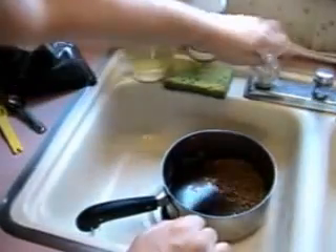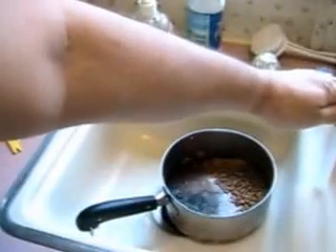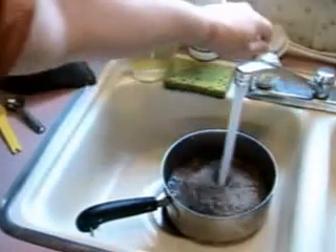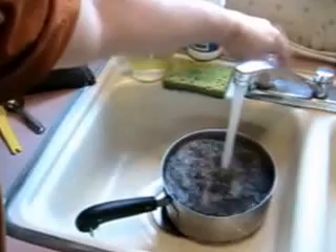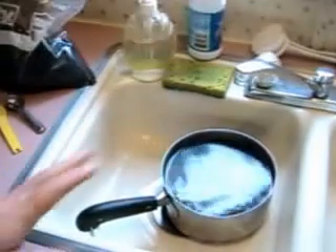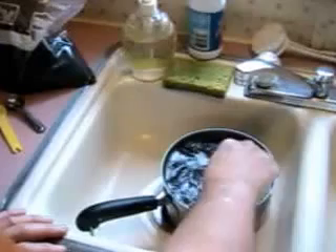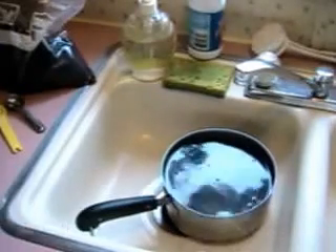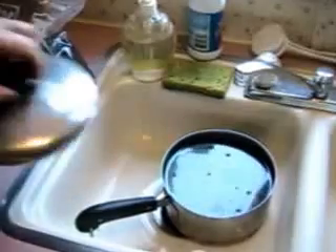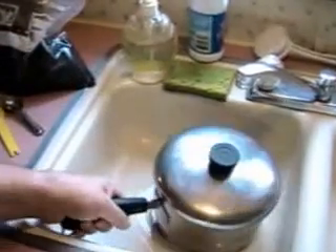Then we're going to add really hot tap water, mix that together, and let this soak for 12 to 24 hours. 24 hours is better than 12, but if you're in a hurry you can do it after 12 hours. So we'll set that on the stove and then we'll pick it up tomorrow.